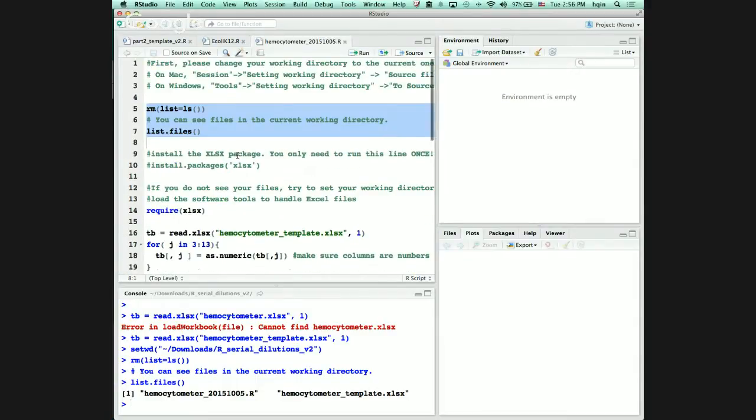Okay, let's do it step by step. All right, so have we all downloaded the new file? Yes, we have it. No, that's the old file. The new file should have a student full name. So if you still see the old file, that means you haven't downloaded the new one. Maybe you should refresh your screen. If you still download the old file, you need to refresh your screen.